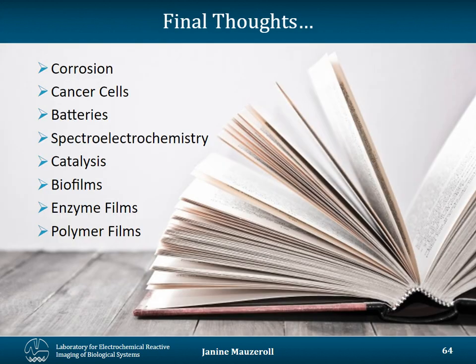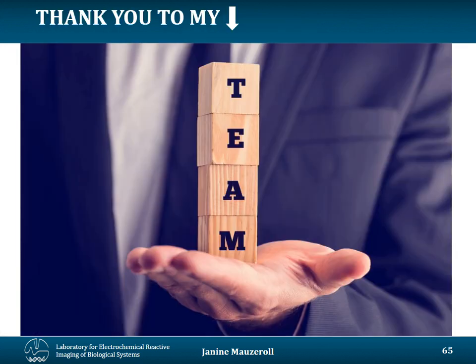And final thoughts, today I talked to you about corrosion, cancer cells, and batteries, but SECM can also be used in spectroelectrochemistry, catalysis, biofilm, enzyme films, polymer films. It's a really versatile method. And it's also easy to modify the instruments to evolve over time.